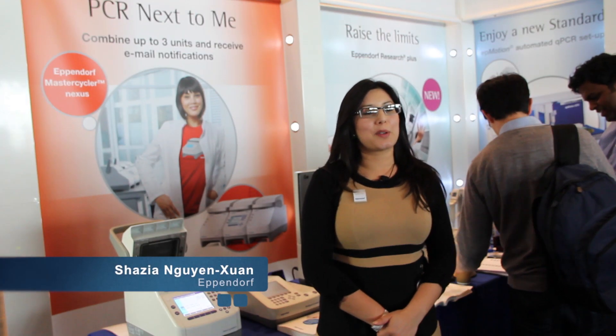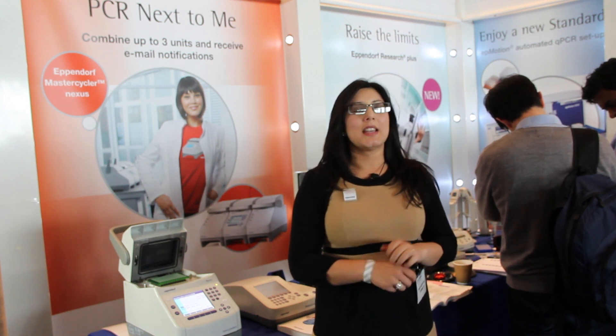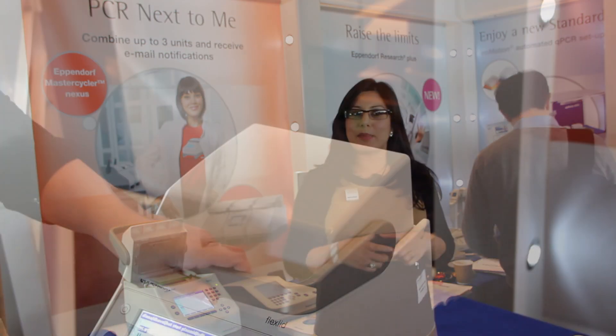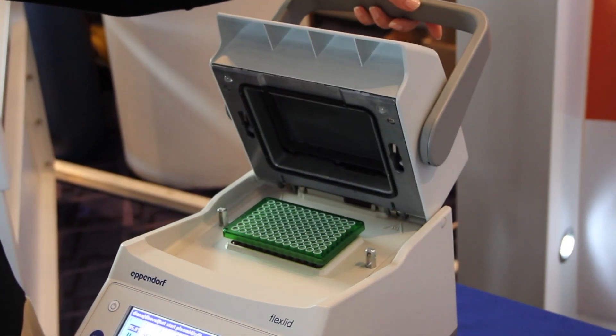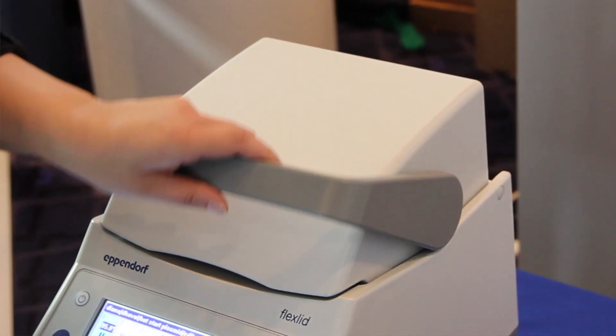Hi, my name is Shazi Nguyenzan and I'm going to be talking about the MasterCycler Nexus today. We'll start from the top. It has a nice hinged lid which you can use with one hand, which is very nice because you always carry a PCR plate in the other hand. It is a hinged lid so you don't have to do dials to put the pressure on, and it will always be accurate.